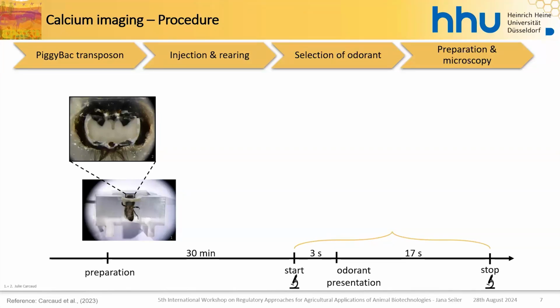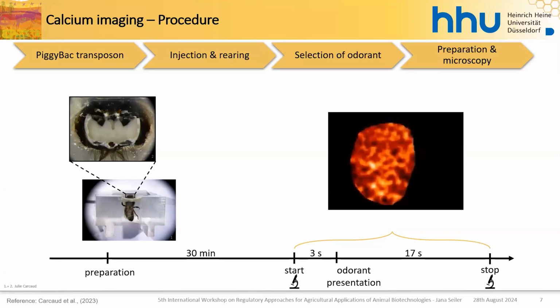After about 3 seconds, the word odorant appears. At this moment, you can see very clearly a change in the recording. Since this may have been a bit fast, I would like to play the video again before I continue.